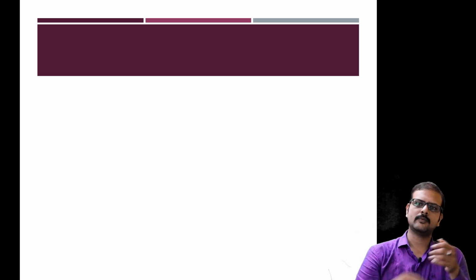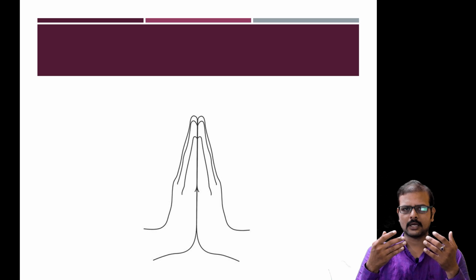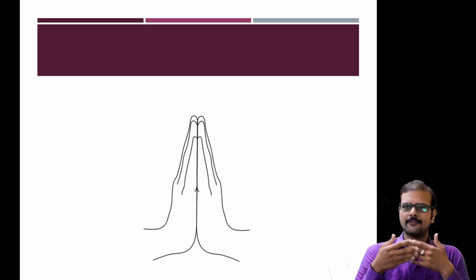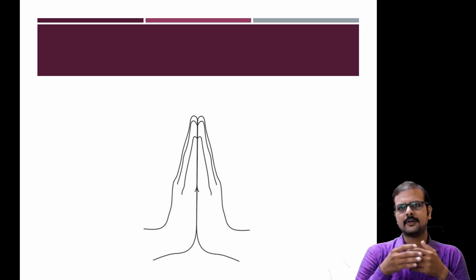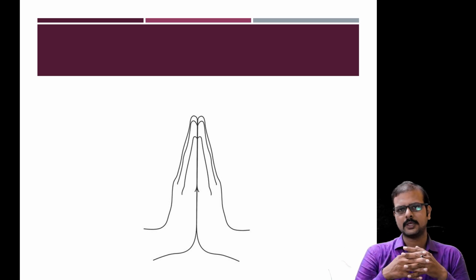In later classes we will see the techniques, different ionization methods, different fragmentation processes, and different peaks which are given in the mass spectrum, how to read a mass spectrum, etc.